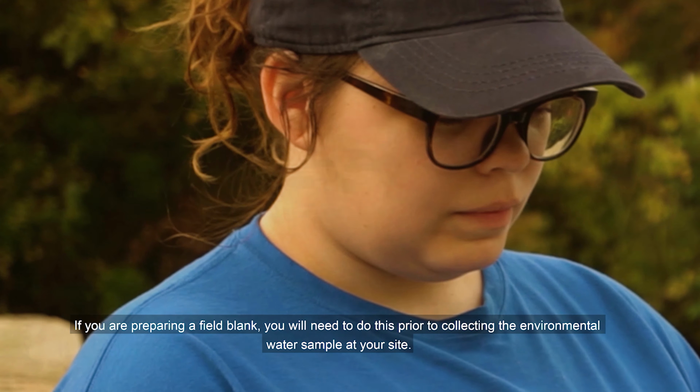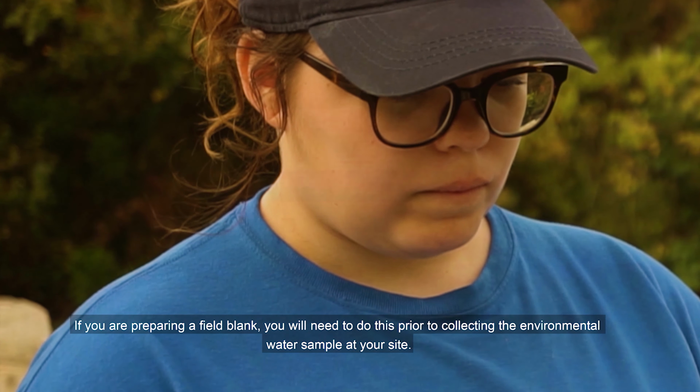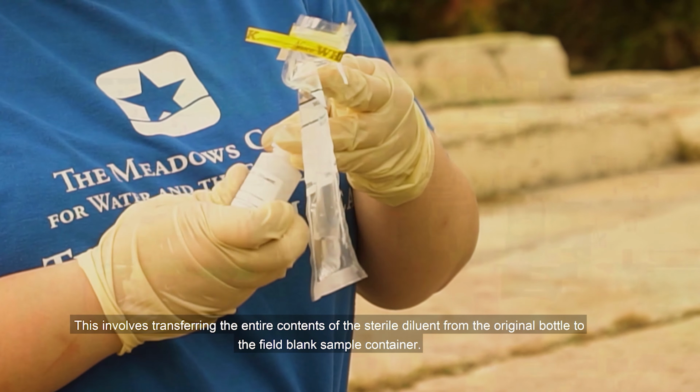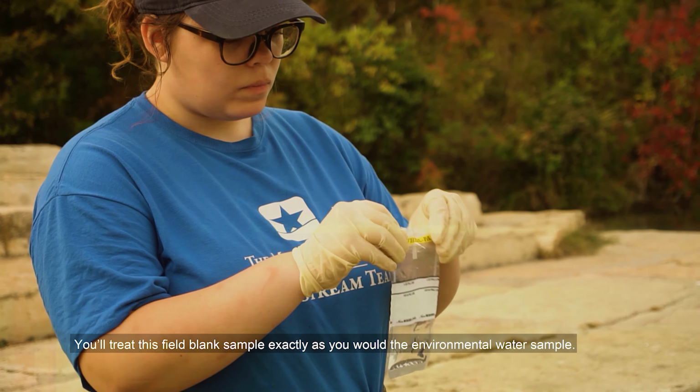If you are preparing a field blank, you will need to do this prior to collecting the environmental water sample at your site. This involves transferring the entire contents of the sterile diluent from the original bottle to the field blank sample container. You will treat this field blank sample exactly as you would the environmental water sample.